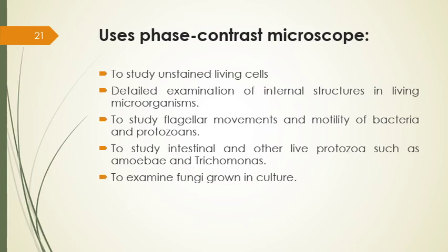It is very effective to study flagellar movement and motility of bacteria and protozoa also, even to study the intestinal and other live protozoa such as amoeba and trichomonas. It is very helpful to examine fungi grown in culture also.